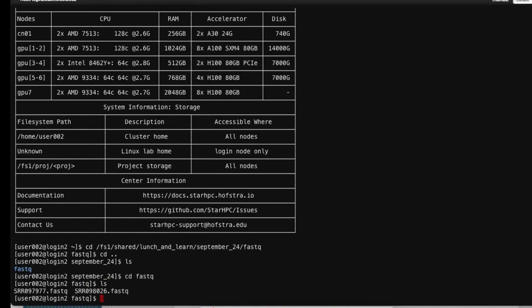So you might be interested in starting to automate something. And with two files, it's not that hard to just do things twice. But if you start having more files, it becomes really important to automate tasks across multiple files. And a really useful way to do that is using what are called wildcards, which are the asterisk character. It can be used to represent any character and any number of characters.